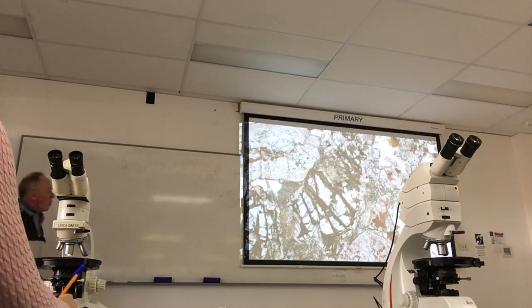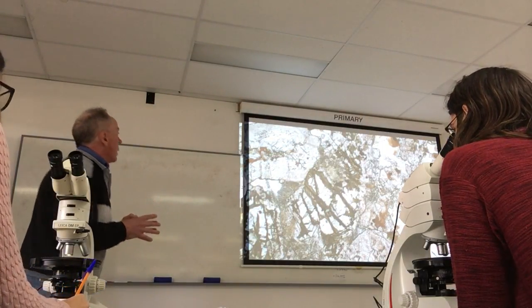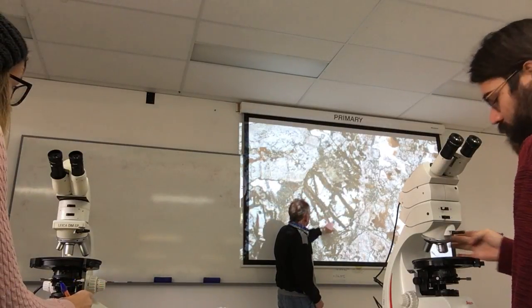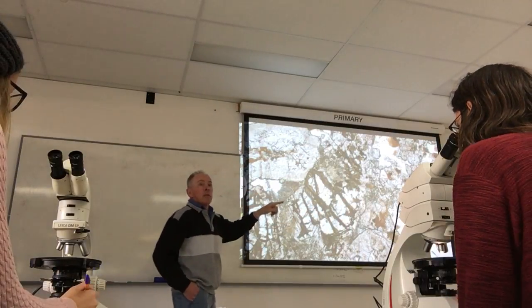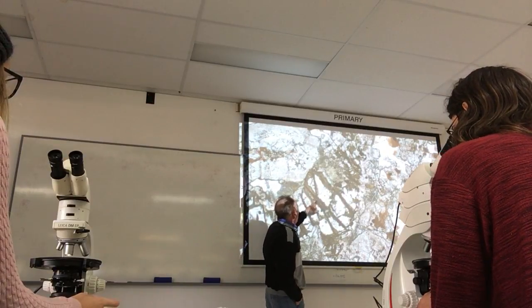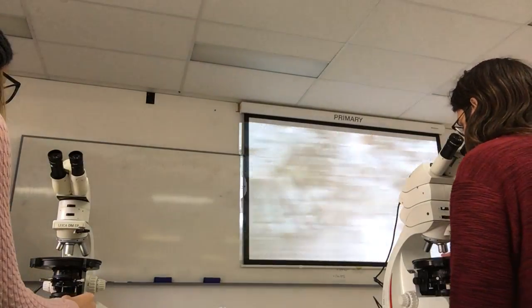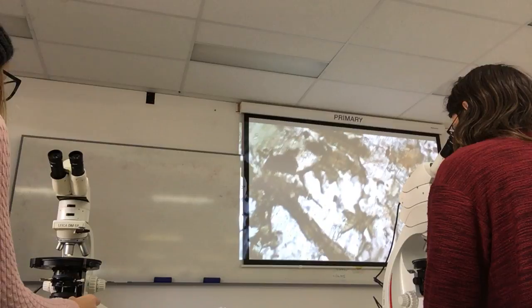Now, a hornblende will overgrow things like olivines and pyroxenes, but it looks quite different to that. The big hint with this one, of course, is that the alteration is coming in along the fractures in the olivine. So the olivine has the conchoidal fracture, fluid seeps in there, and the olivine becomes quite unhappy. In this case, it's altering to that green gunk that's there. Let's have a closer look at the green gunk, and you'll see.